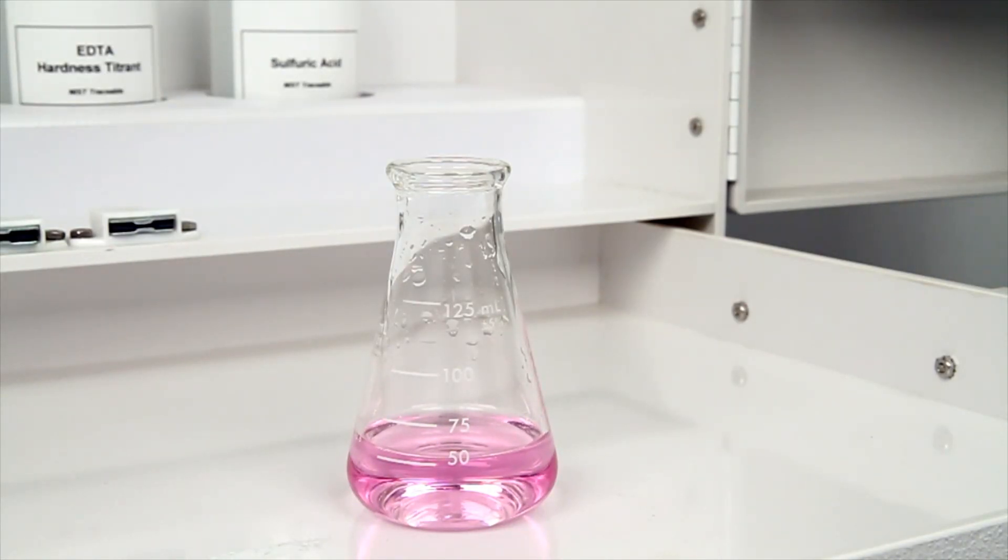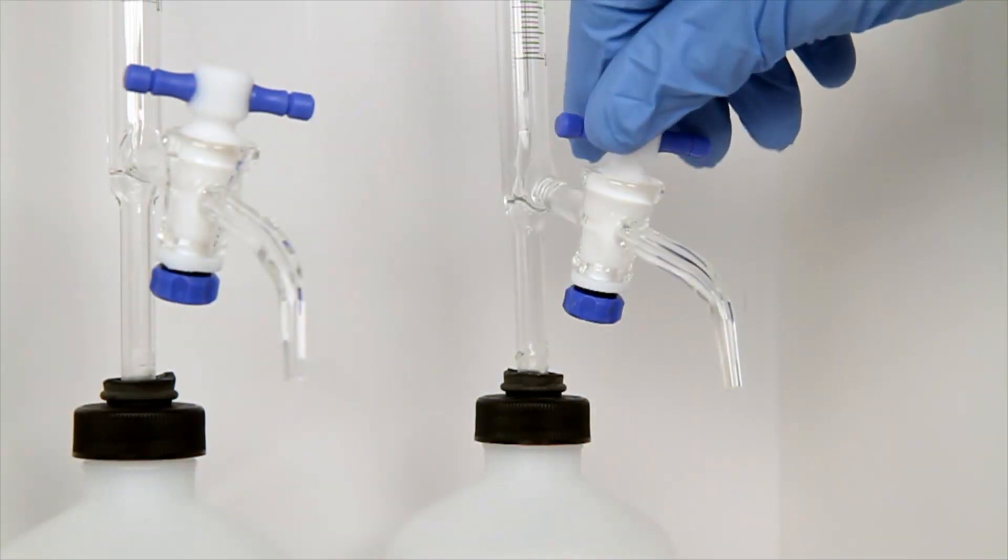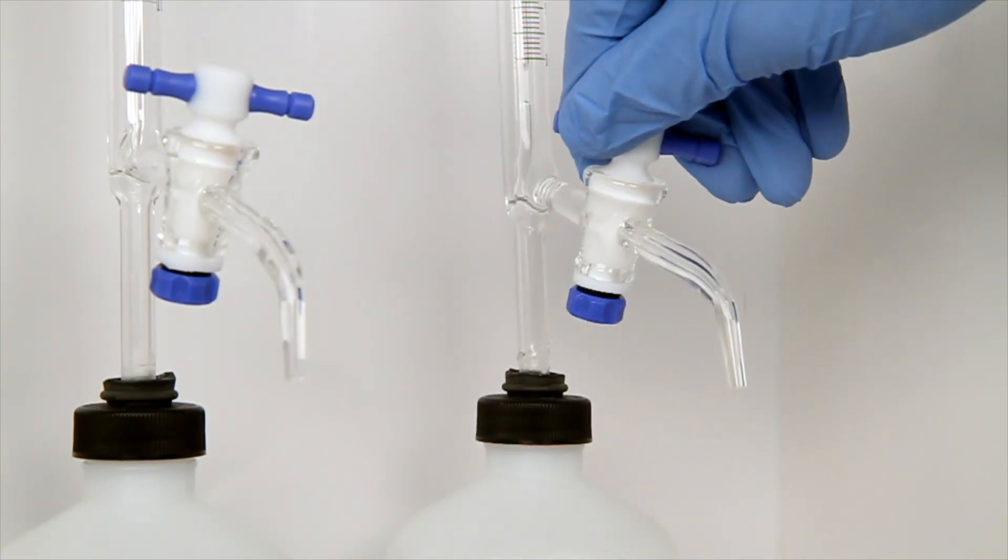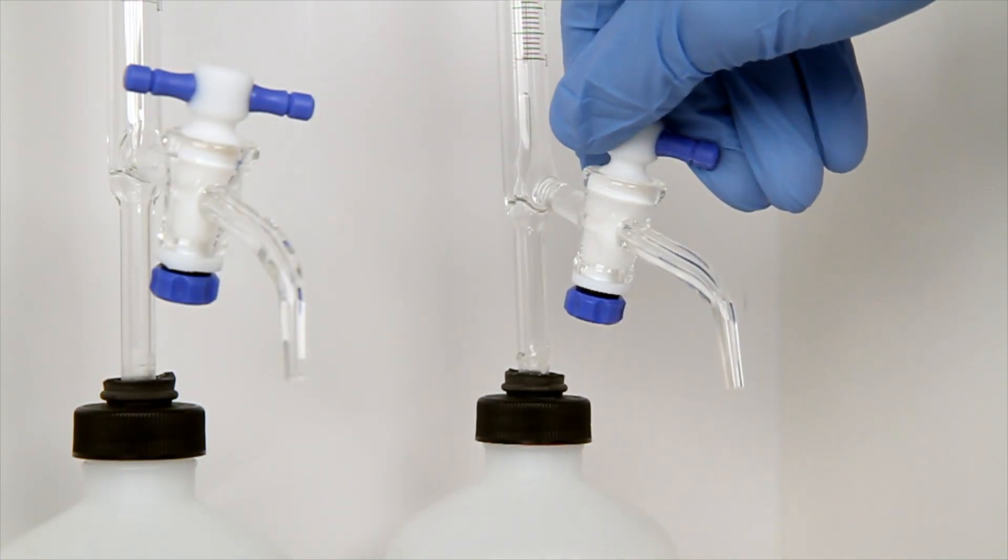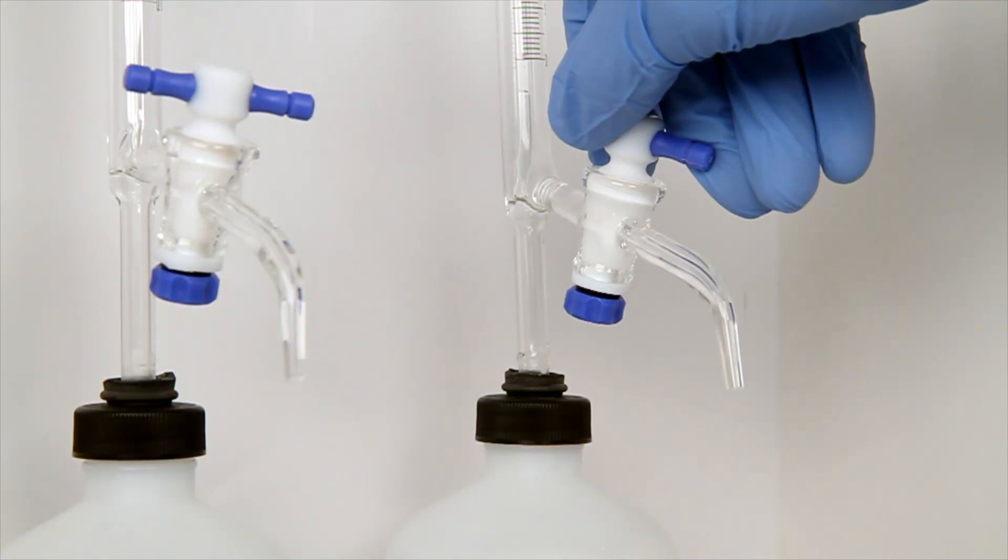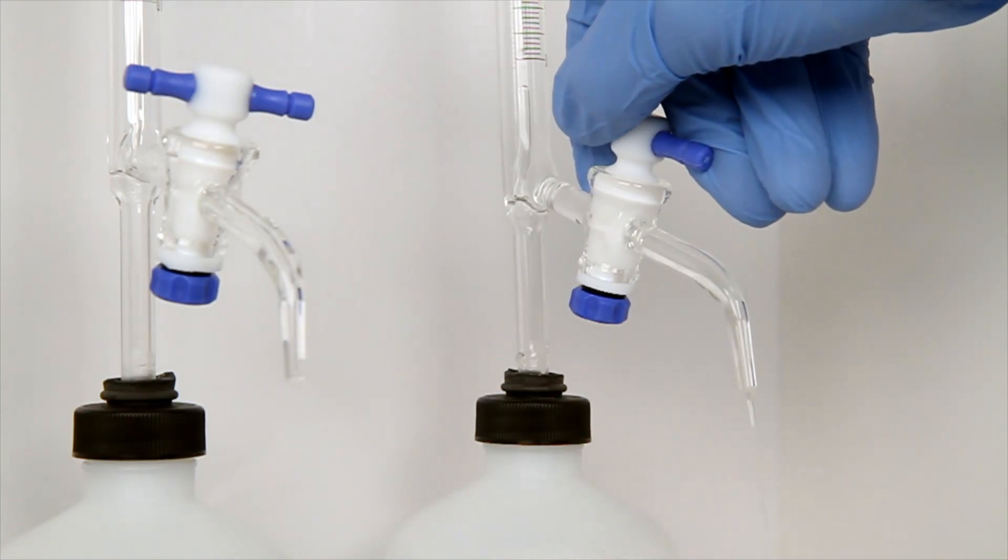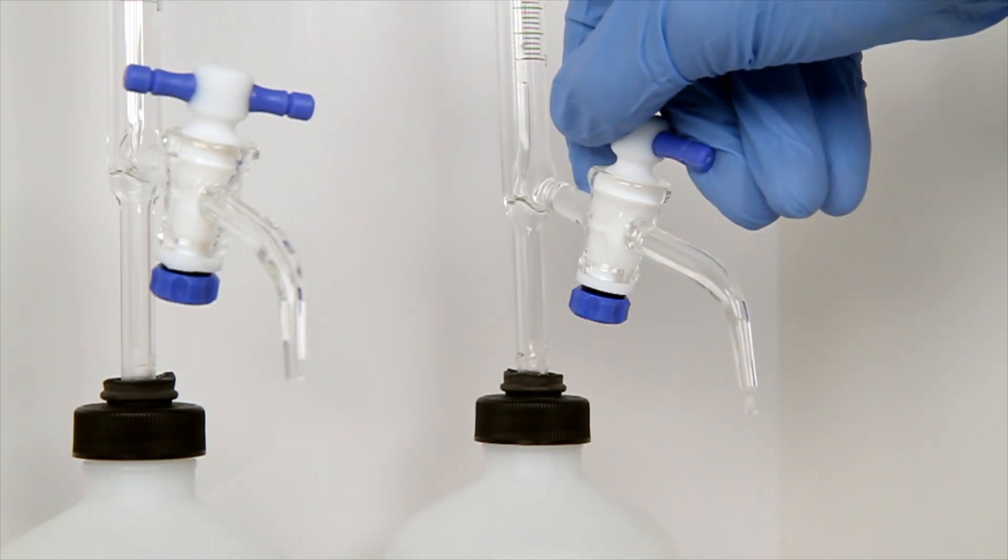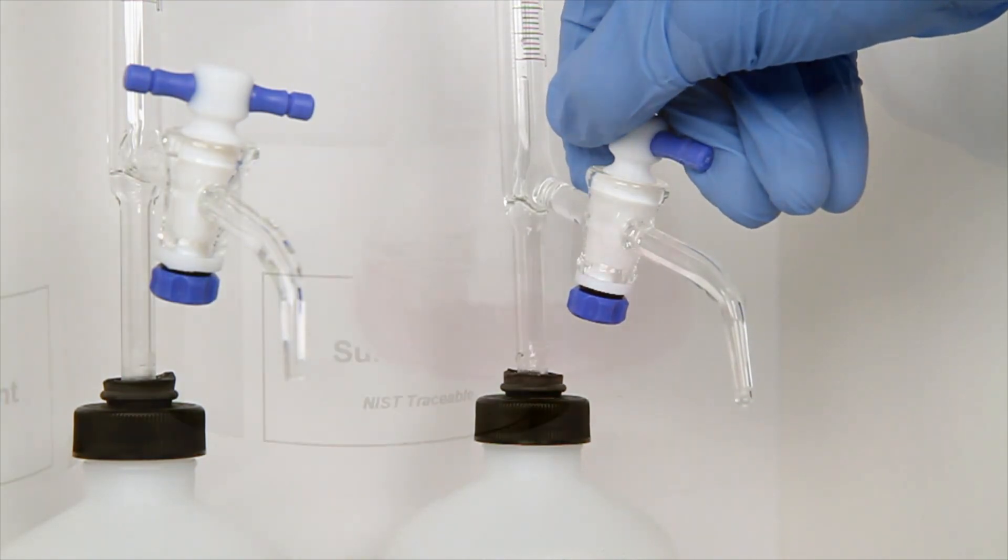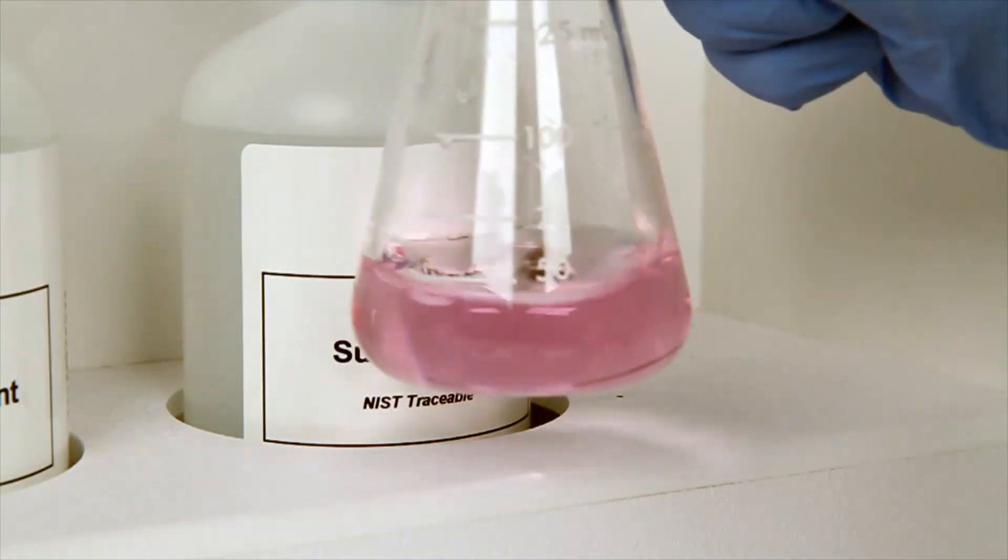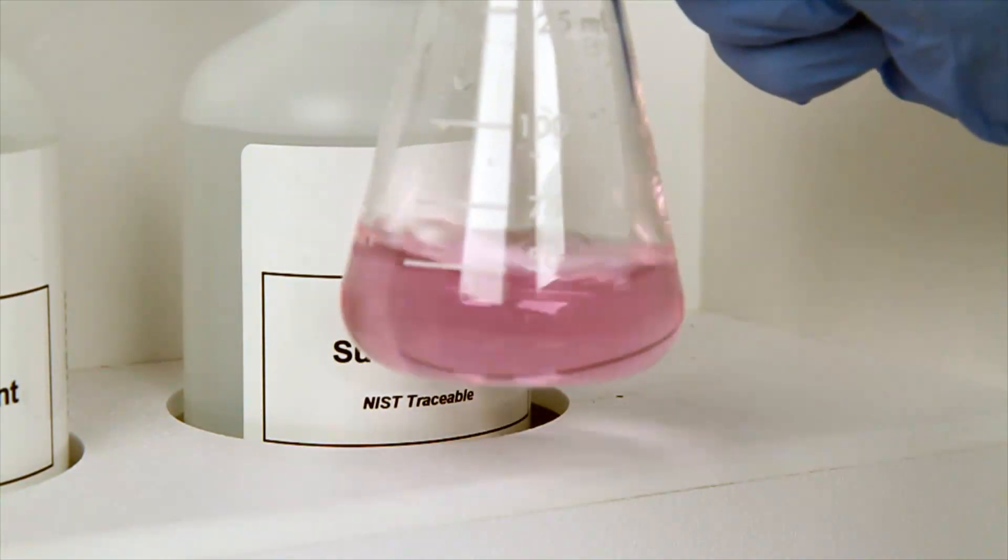In this example, the sample turned red, indicating that there is P alkalinity that needs to be titrated. The next step is to titrate the sample with the sulfuric acid titrant using the burette. Make sure you are mixing the sample after each drop until the sample color changes from red to colorless.